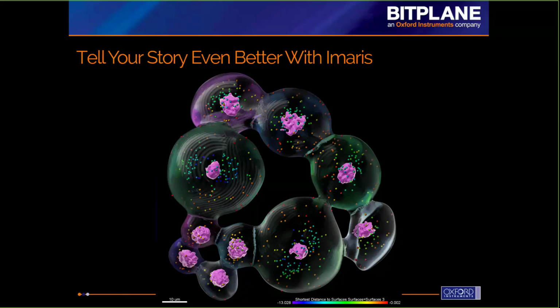this release is to make it so much easier for you to do and so much faster, as well as to help you present it in a better way so that you can tell your story more easily and convey to your audience more about what your results mean rather than just what your results are. You can spend more time talking about your conclusions instead of just trying to point out what's in the image.